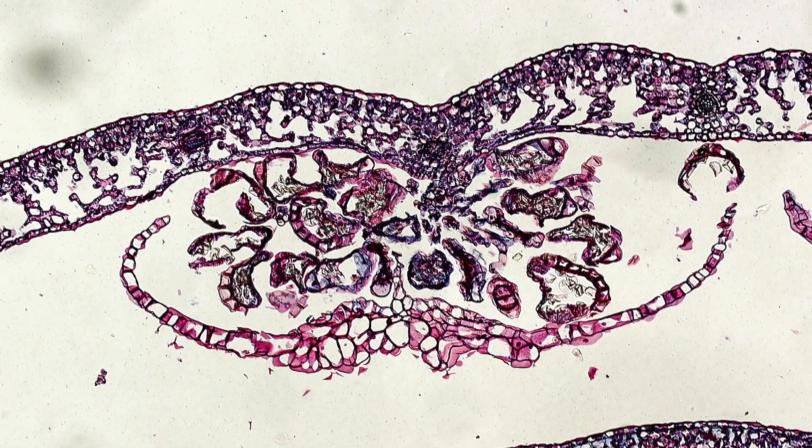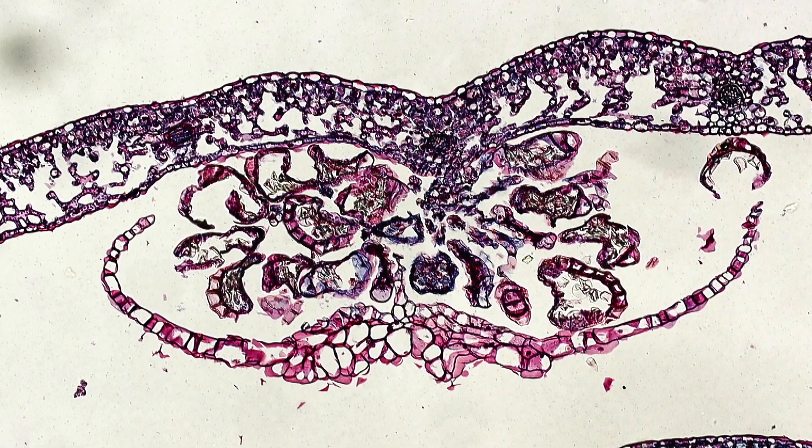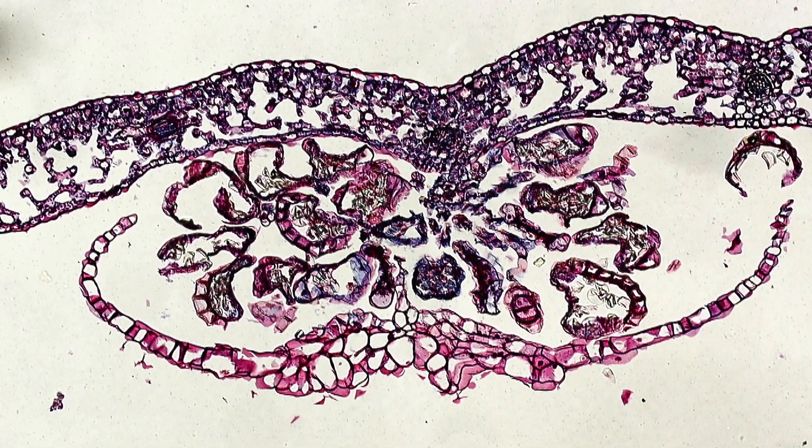So hi, hello and welcome again. Microbe Hunter here. What you see here on the computer monitor behind me is the cross section of the leaf of a fern plant. It's live from a microscope here. Today I'm going to put a fern under the microscope.